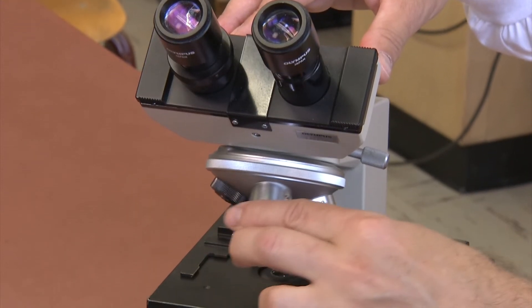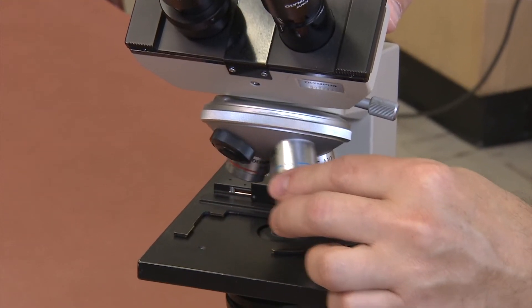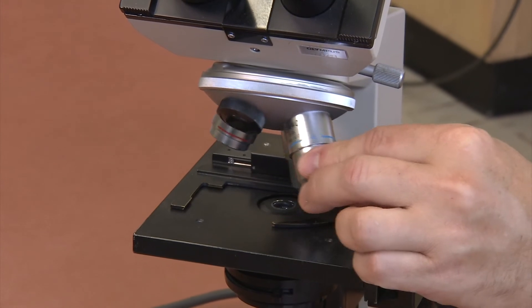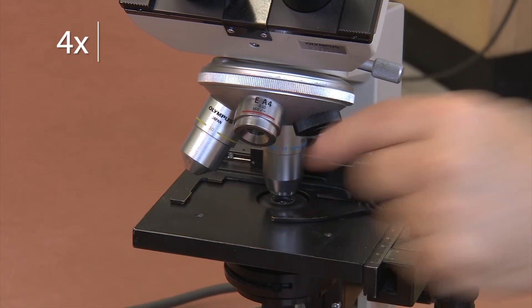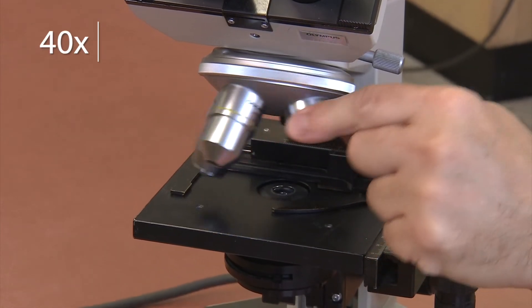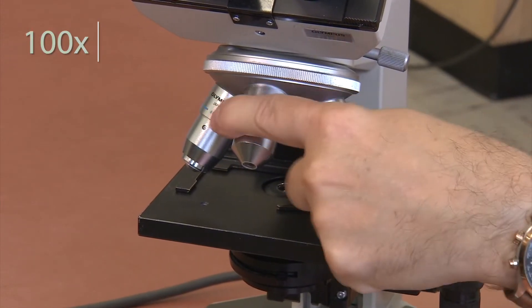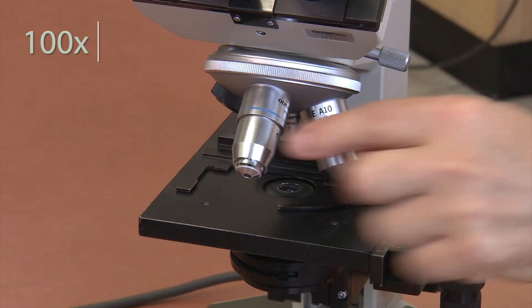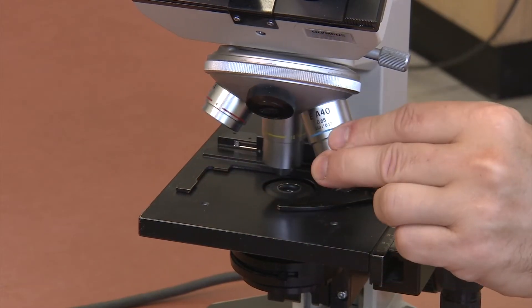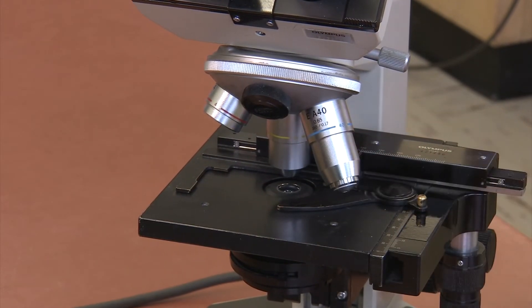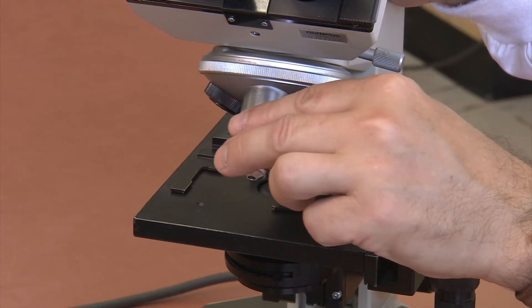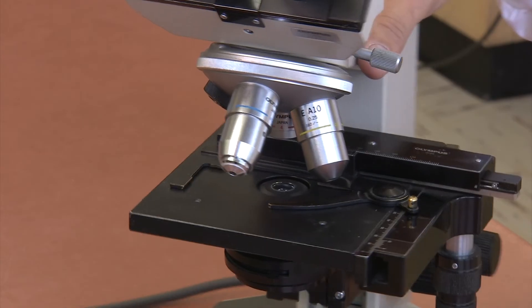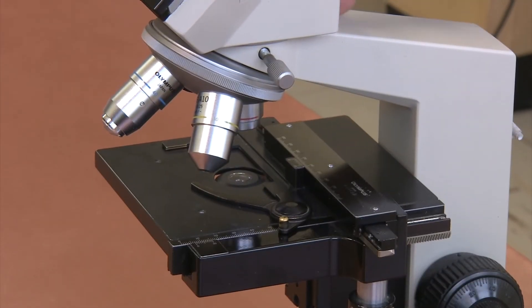Below the binocular tube is the revolving nosepiece and objective lenses. Most compound microscopes have three or four objectives: four times, ten times, forty times, and sometimes a 100 times lens that is only used for oil immersion. Together, the oculars and objective lenses magnify the specimen. Rotating the nosepiece switches between objective lenses so that you can change the magnification.